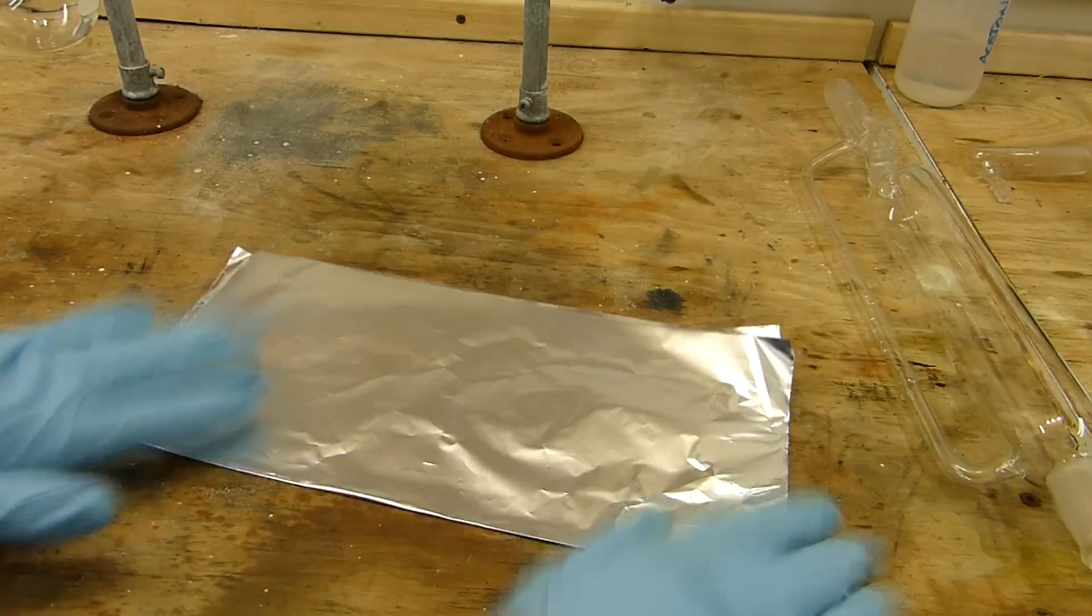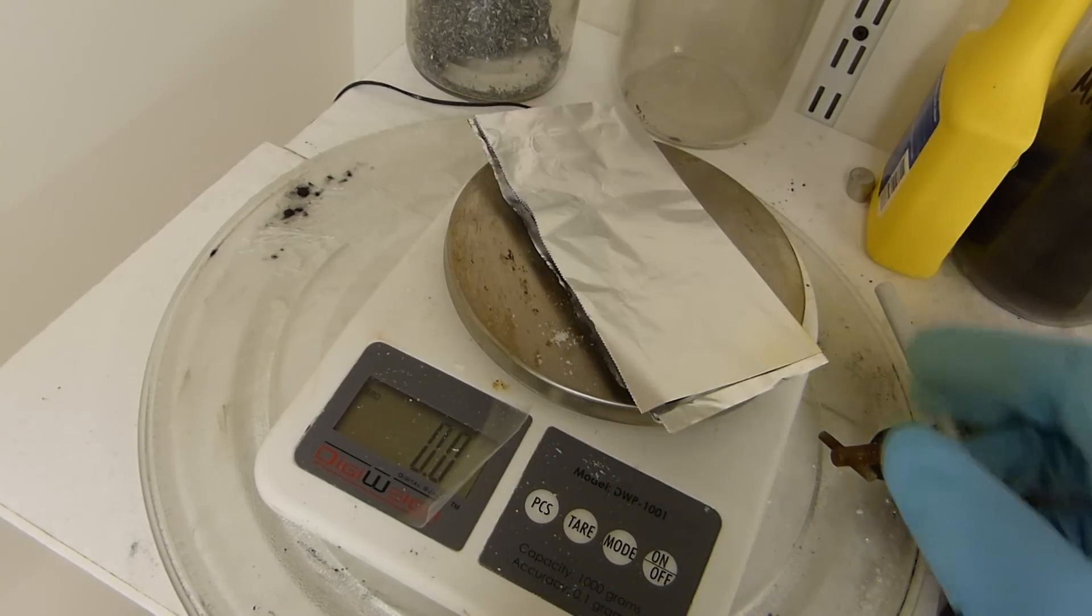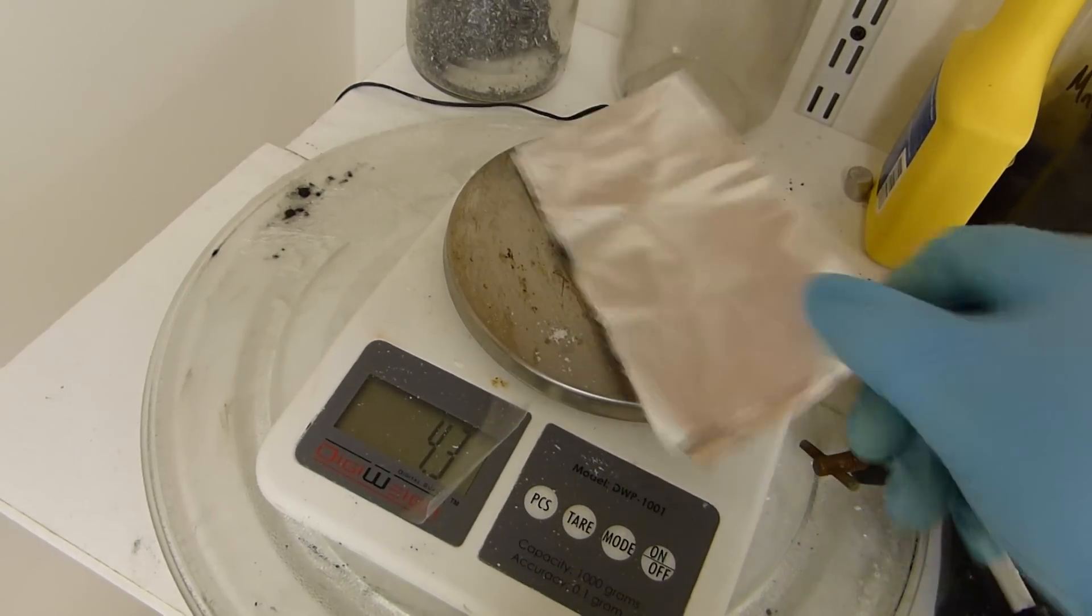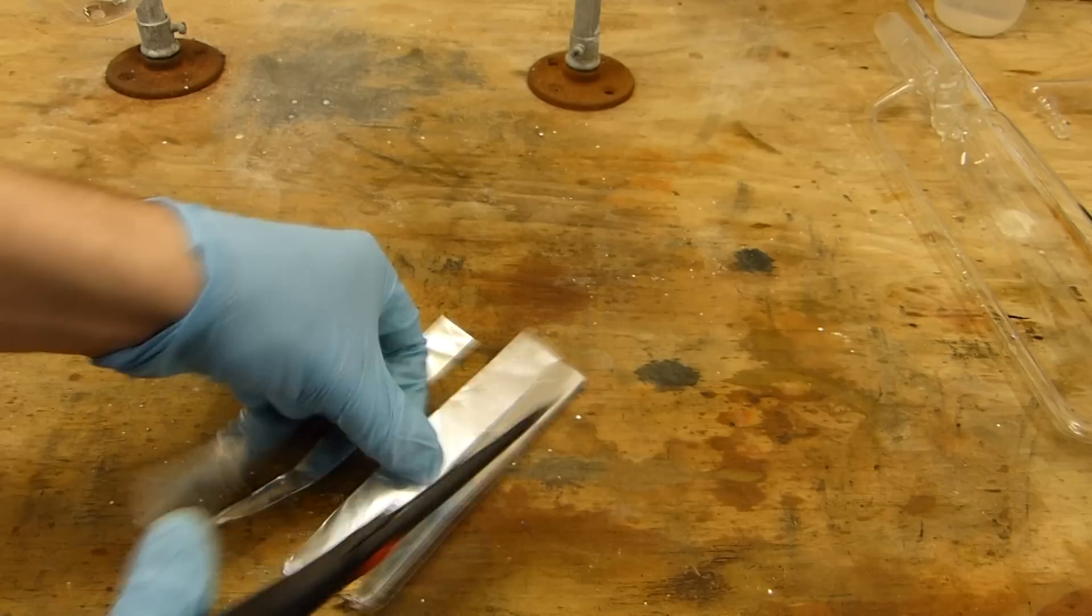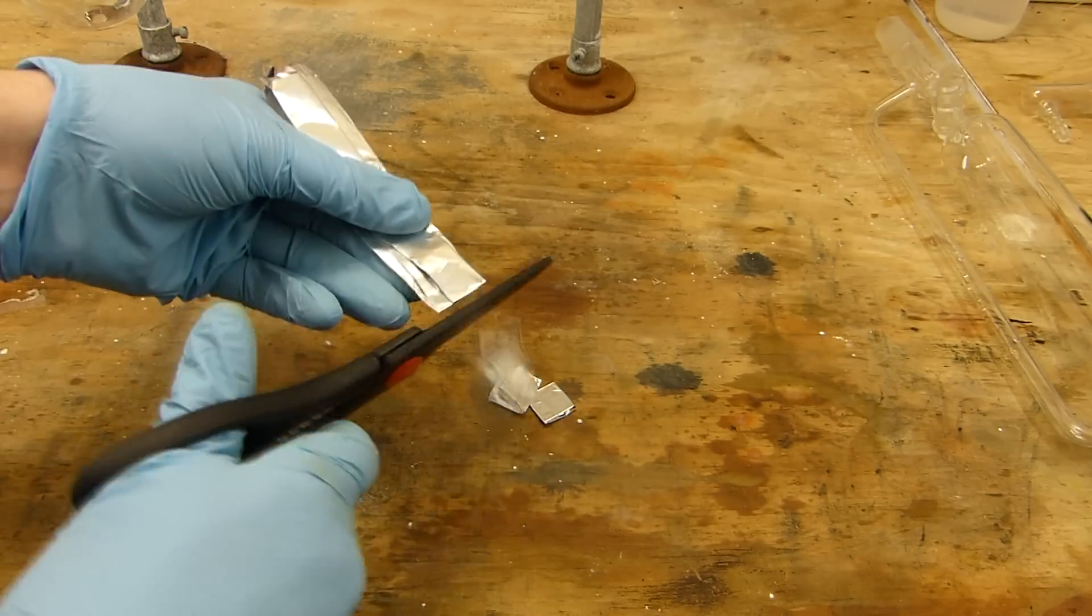I'll start by just weighing this piece of aluminum foil. I'll fold it a couple of times and weigh it to find it weighs about 4.3 grams, and then I'll proceed to cut it into confetti and add it to this flask.